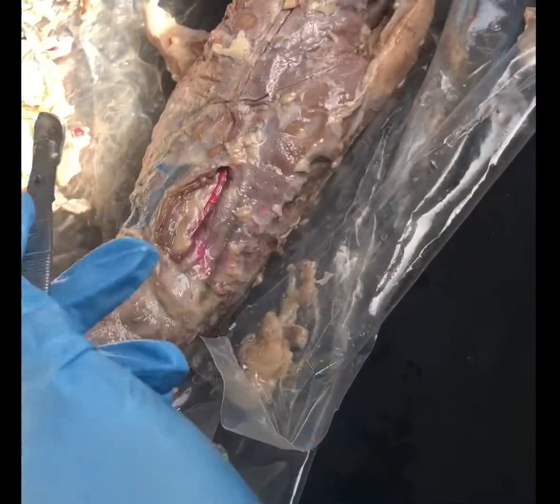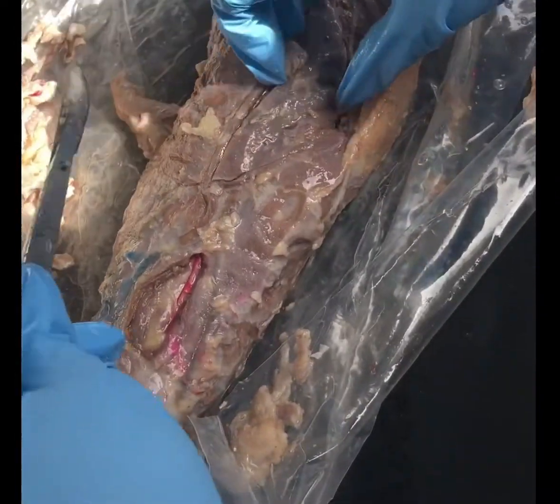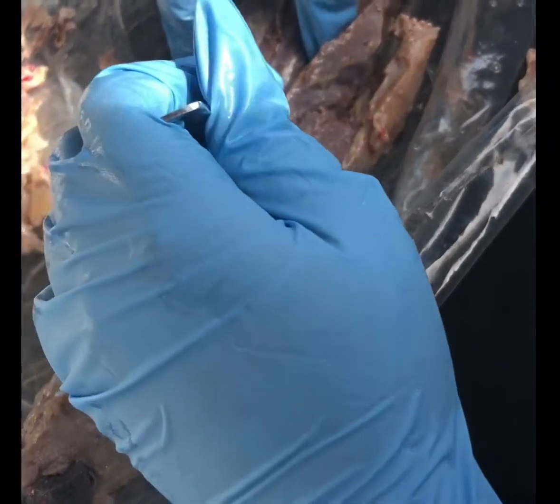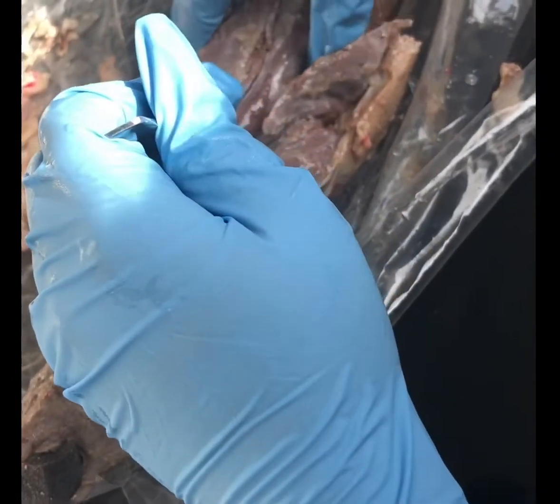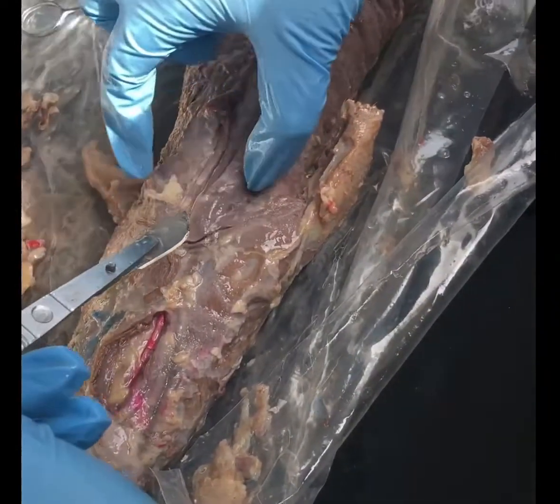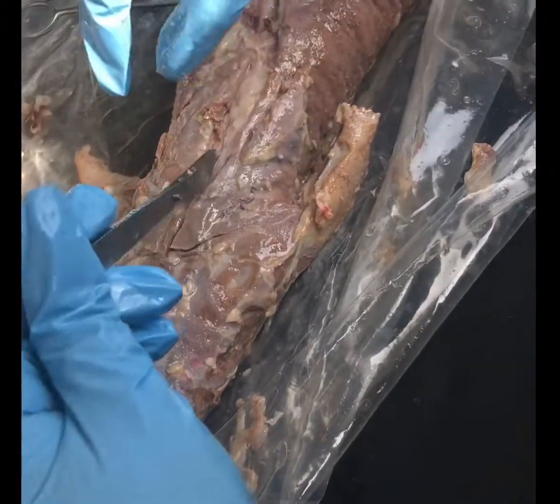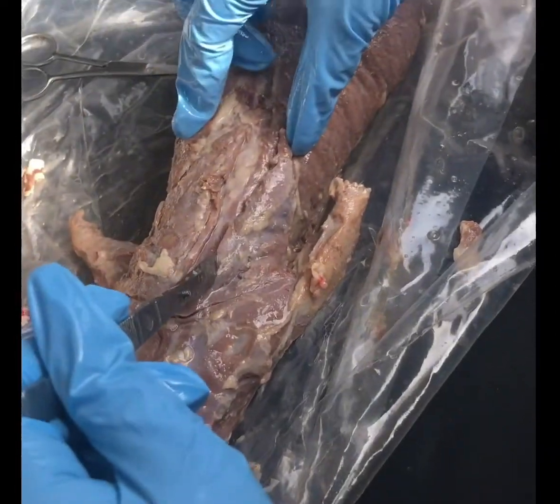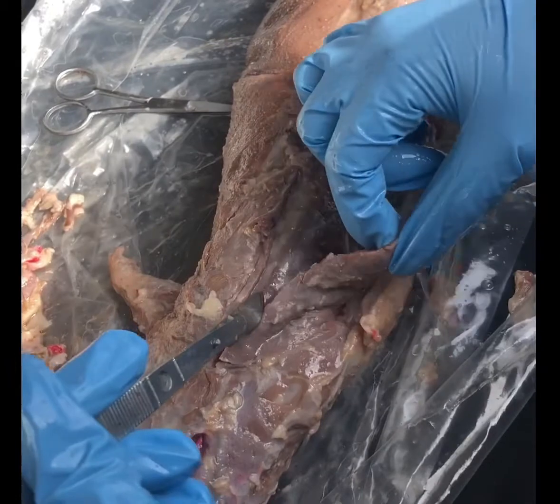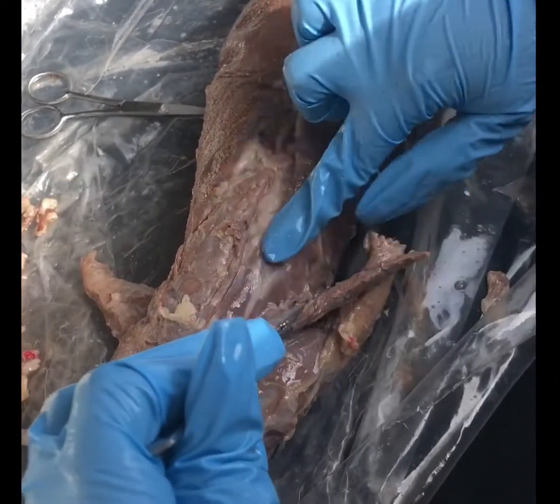Okay, now the muscles of the chest. No, not the chest, the abs. So we're gonna start with the rectus abdominis, which flexes the vertebral column, which is basically this whole muscle right here, like the abs. And then the external oblique is gonna be this muscle right here, the outside. The internal oblique is gonna be the inside.